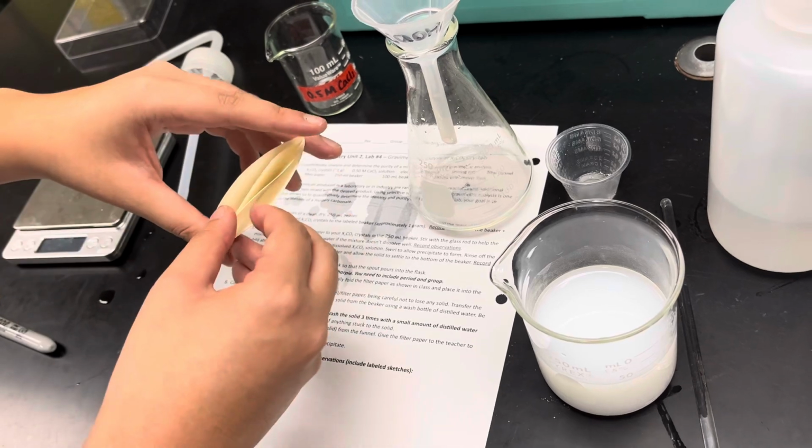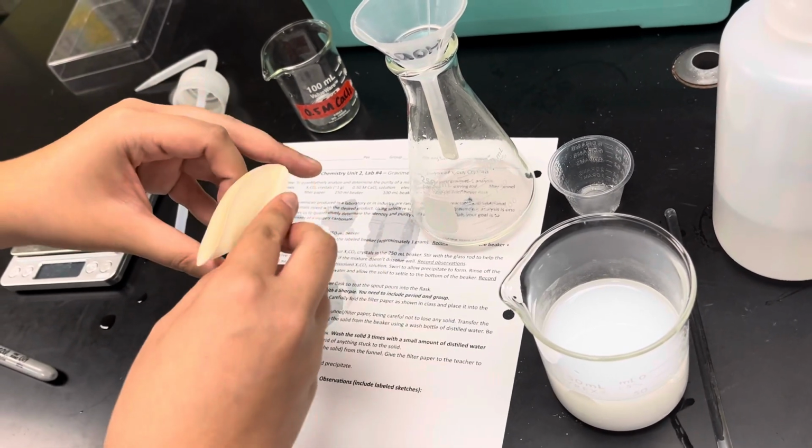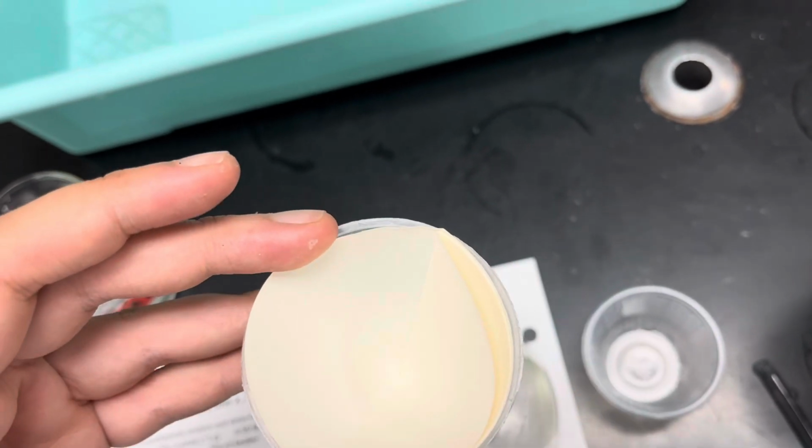So when I open it, I don't want to open it in the middle, because if I open it in the middle, then there's going to be this big hole. So I need to open it with 1 paper on the top and 3 on the bottom, so there's no hole. And I'm going to put it in my funnel. A trick you can use is you can put a little bit of water in it to keep it down, or you can just hold it with your fingers.